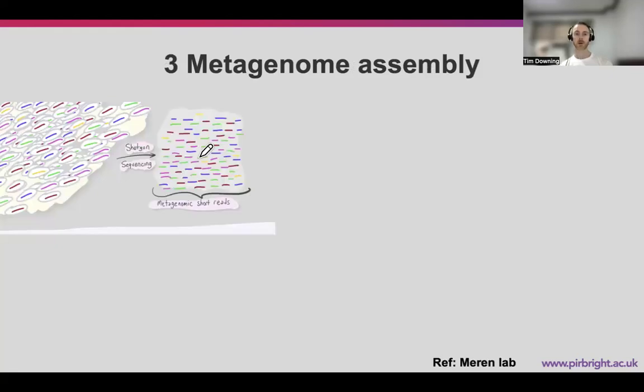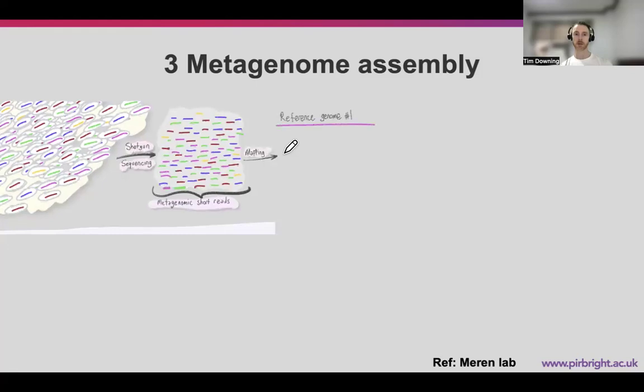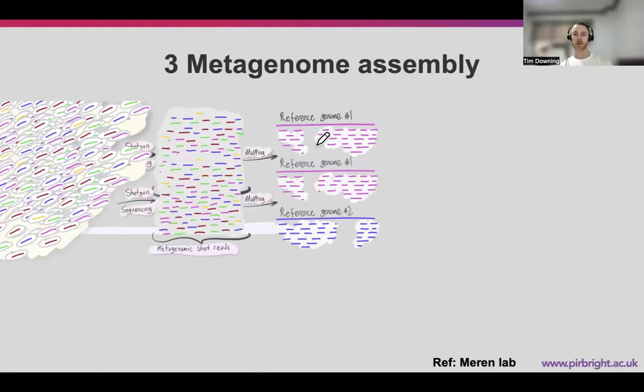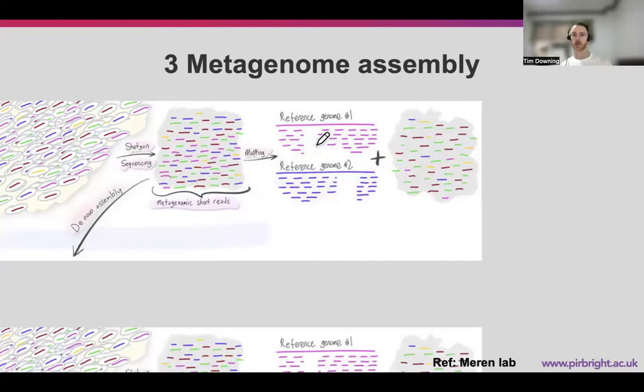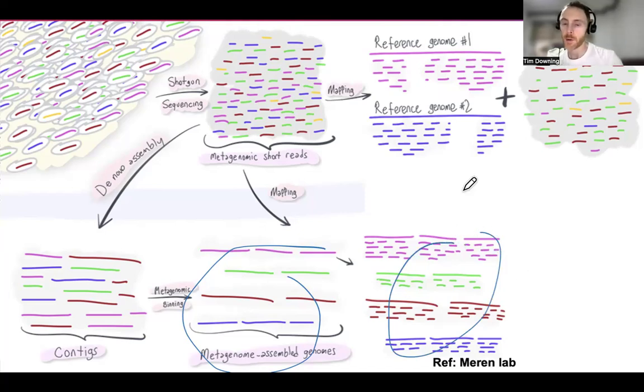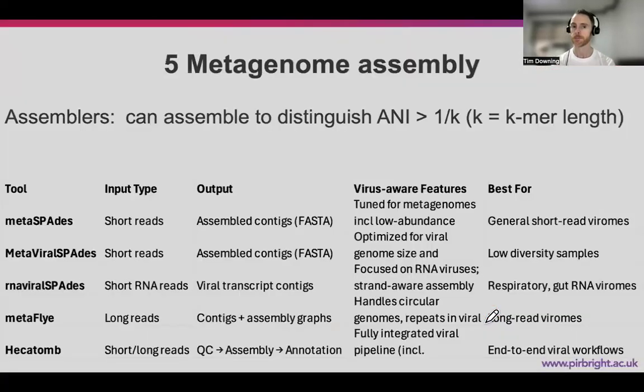We're doing shotgun sequencing where we have many genomic short reads, and from these we can extract particular reference genomes and map reads to them to check their integrity. But we can also just use metagenomic binning to explore these as well, to create metagenome assembled genomes and map the reads back to these as well. These are more fragmented and less clear, and they're different to the reference-based approach above, where we have existing reference genomes that we know more about. So we're mainly focused on this part down below.